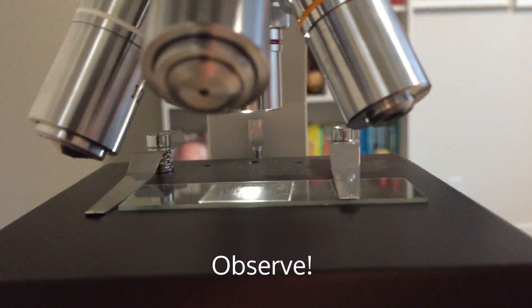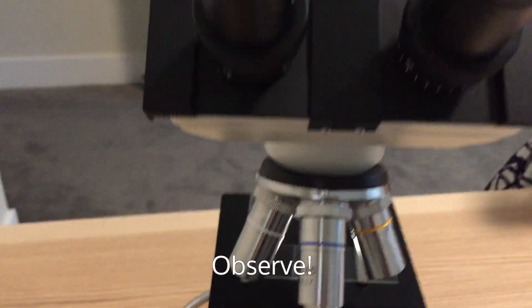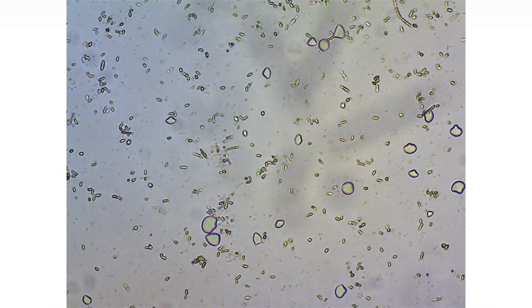Observe your Kombucha under your microscope. I use the low, medium, and high objectives on my microscope. These are the results I got.